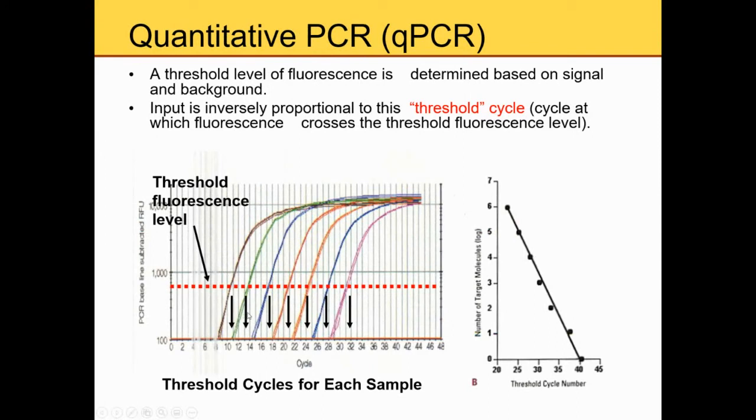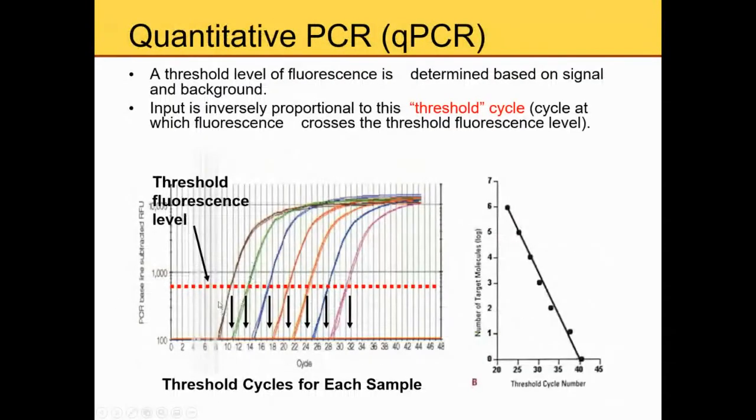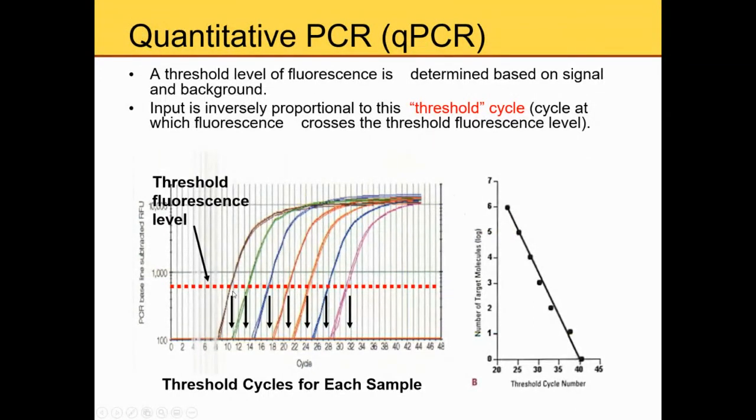And for the qPCR, basically how you monitor the DNA in real time. That's because the dye that you added to the system can be recorded by the machine. All right, so basically it depends on the threshold level.